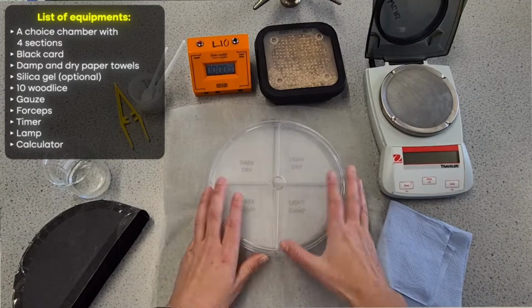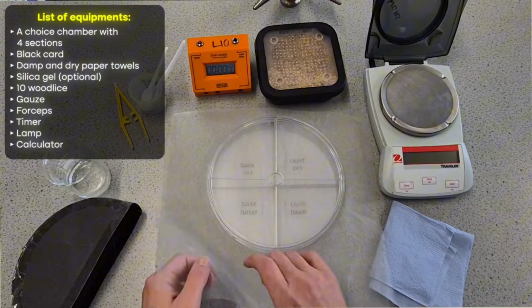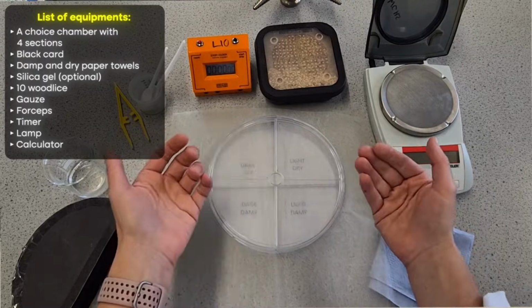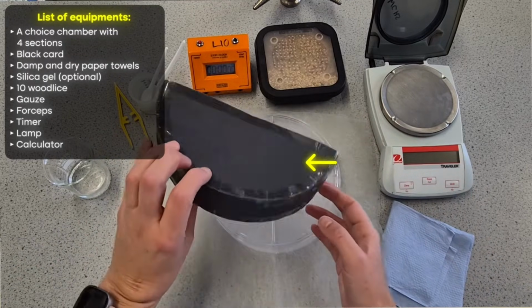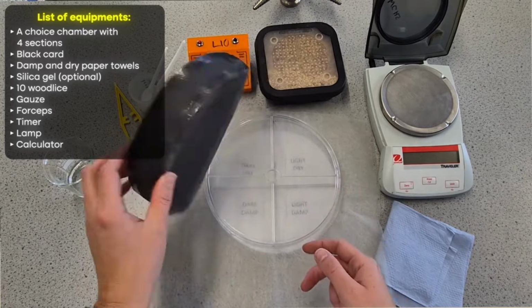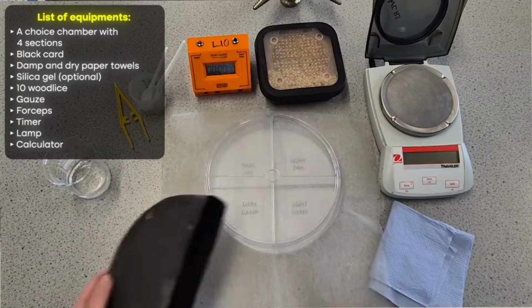Now, the reason for that is the first piece of mesh is to stop them escaping from the bottom and so they can move more easily. The top one is to stop them from escaping from the top, because they could come out of that part otherwise. And then I've got this pre-cut out section of black paper that will slot over the side that says dark and dark to make that our dark conditions.